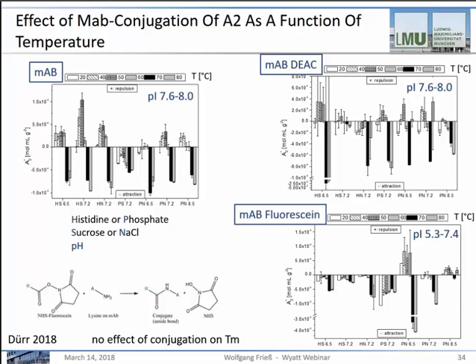When we look at the middle, we see, for example, phosphate with sucrose pH 7.2. We have much more attractive interactions to start with, and upon unfolding, it becomes more and more difficult to really tell a difference.